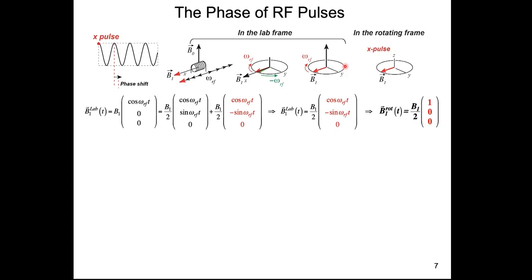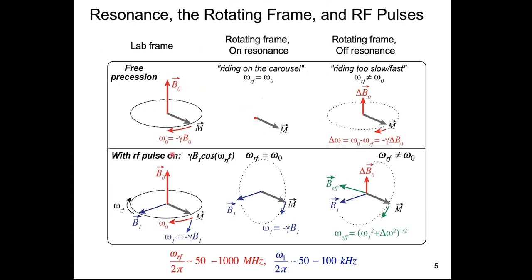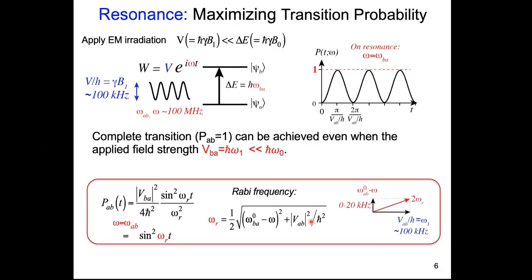Okay, now I want to speak a little bit about the phase of the radio frequency pulses, and this relates to a couple of slides back, when I sketched in a hand-waving way the direction of the B1 field. Let's say in the rotating frame, the B1 field is somewhere different from the magnetization direction. As long as that's the case, you'll have nutation. If your B1 field happens to be along the initial magnetization, well, nothing happens because the precession just won't work. And so how do you know what the B1 field direction is?